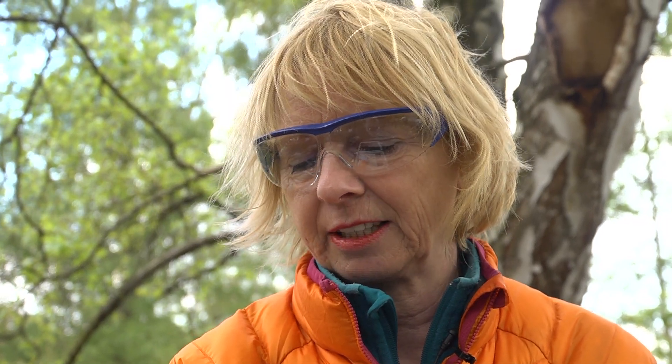Reaction time is 2 minutes. If the sample is very cold, we have to wait a little longer, otherwise the readings could be too low.